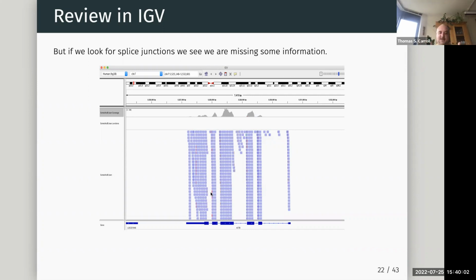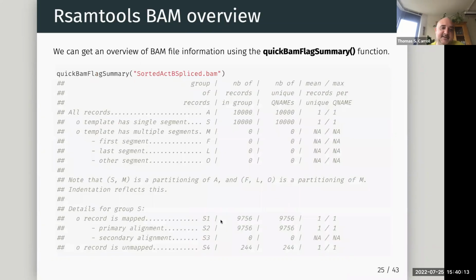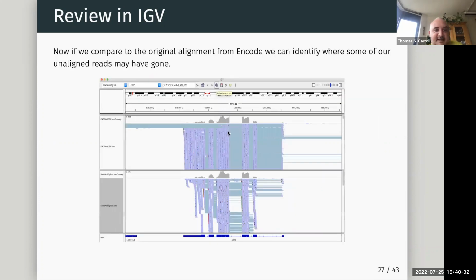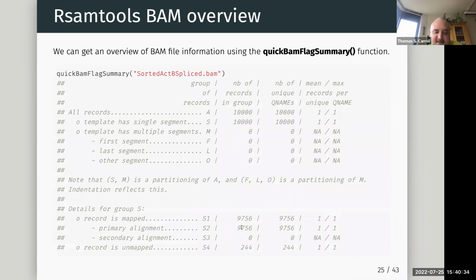Once it's built enough subreads that it's saying it's most likely this region, it will try and effectively clip off the end of the reads to make sure it can align to an exon. Okay. So actually, when we run this in a spliced mode, what we're really doing is allowing the reads which were previously clipped, because we weren't looking at a splicing alignment, to now be actually mapped across exons. Okay, so it's just changed the way that those reads map. And that's why we're not seeing suddenly a ton more reads.